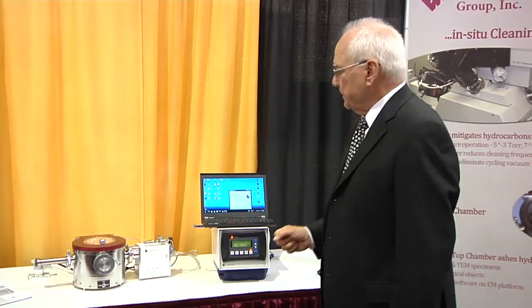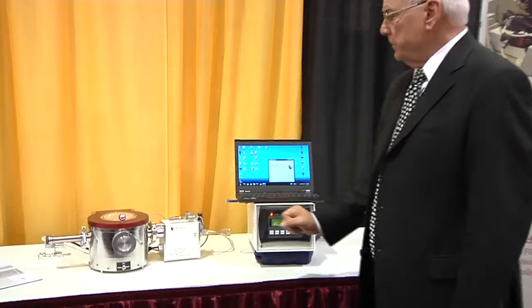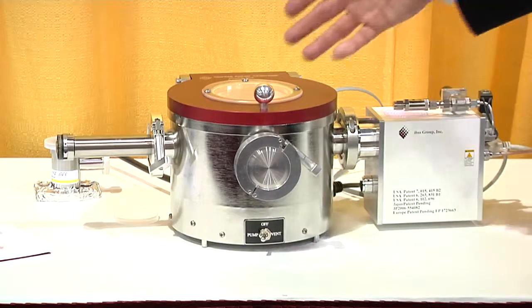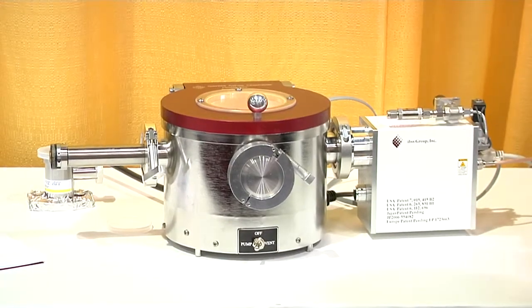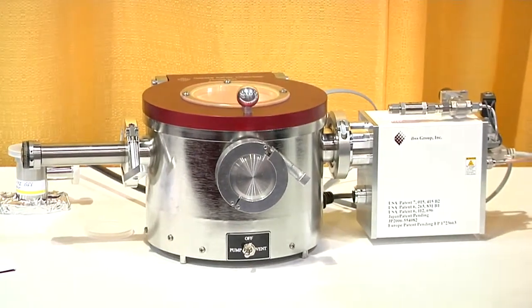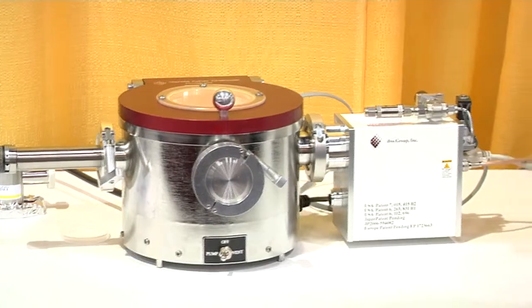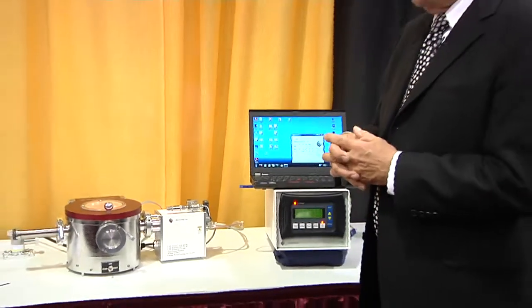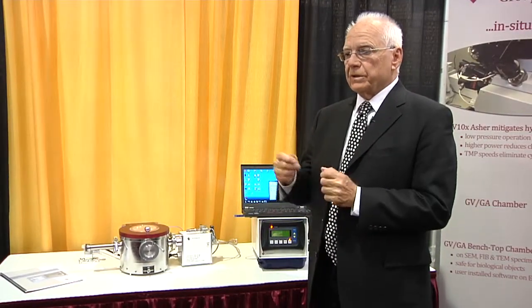The way it works is that this device and this device fit onto the electron microscope, and when it is turned on, it creates a plasma in the source, and what is downstream is the downstream plasma. In the downstream, we do not have any charged particles — we have all neutral particles and especially atomic oxygen. The atomic oxygen is what removes the hydrocarbons from both the gas phase and the sample's surface.